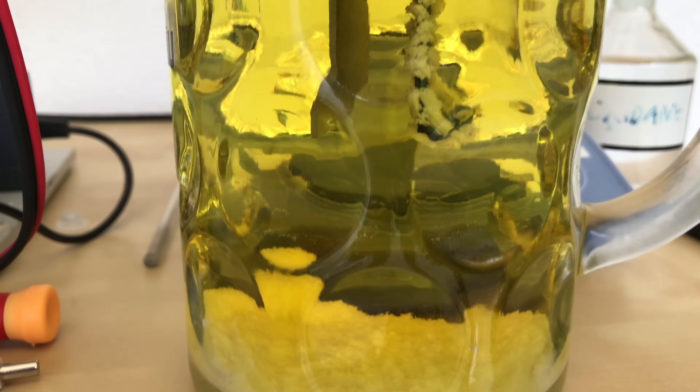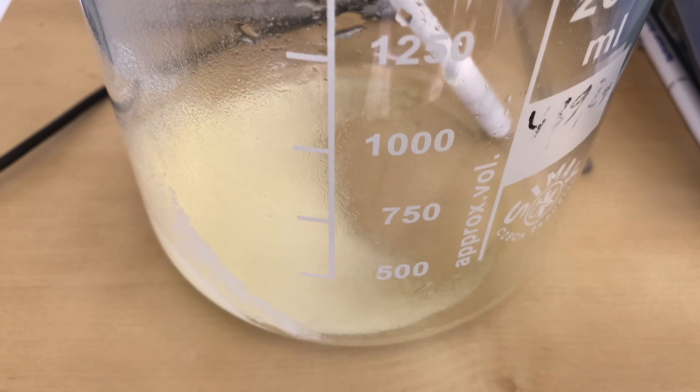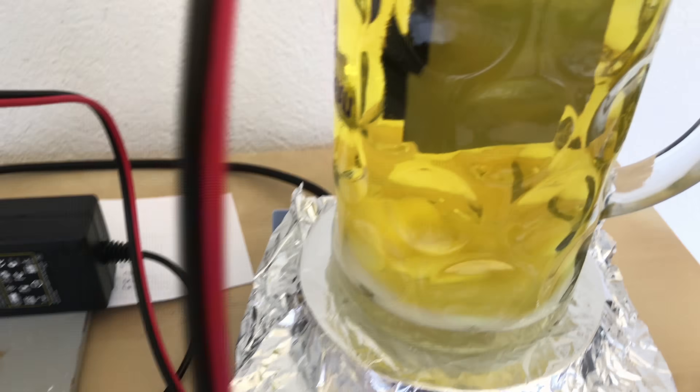24 hours later: the next day a lot of crystals had already separated out. You can see that some of them settled on an electrode because overnight the solution cooled down way too much. The contents of the electrolysis cell were poured into a large beaker, then the solution was poured back into the electrolysis cell leaving the powder behind.